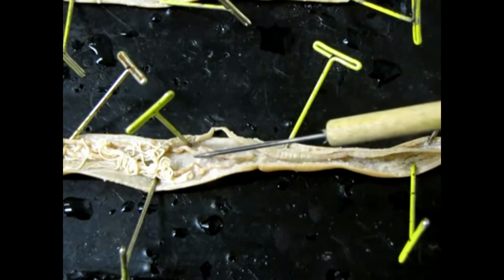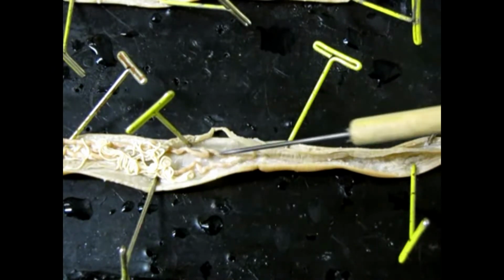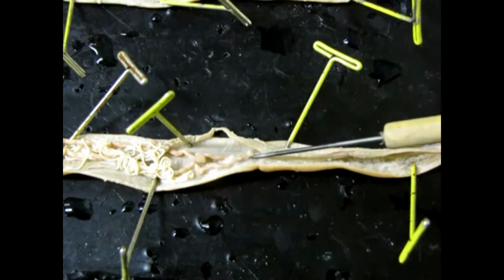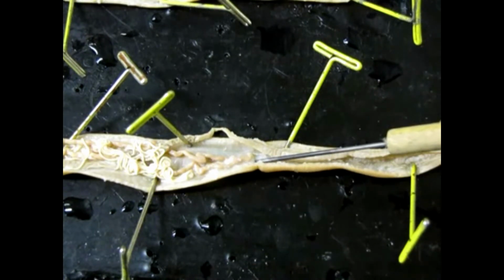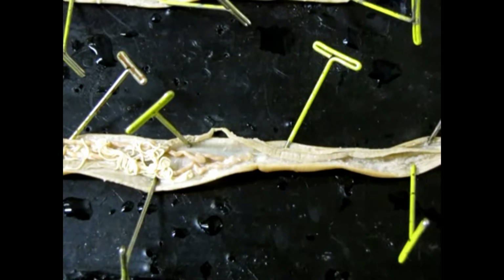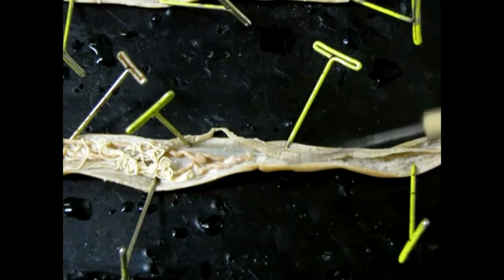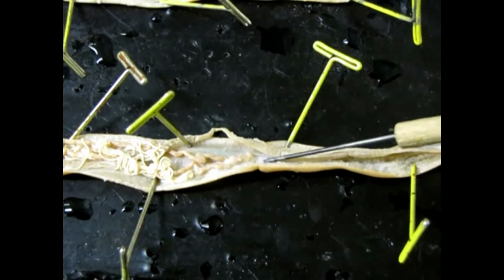So this is one uterus, two uteri, and you can see that they meet at this Y or V-shaped junction right here. Okay, and right at the end of it, there's a small little passageway there, and that passes directly out to the exterior of the animal through the genital pore, which you saw on the external anatomy. So this is where sperm enters and where eggs exit, is the genital pore. So that's closer to the anterior end of the body.